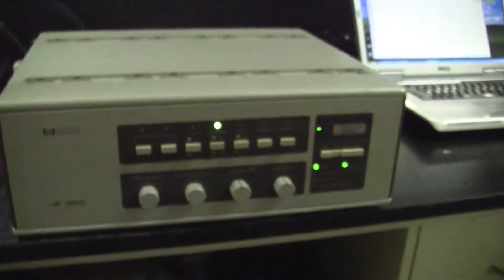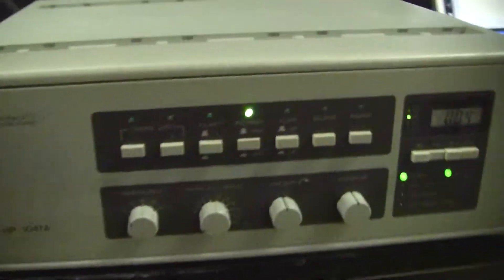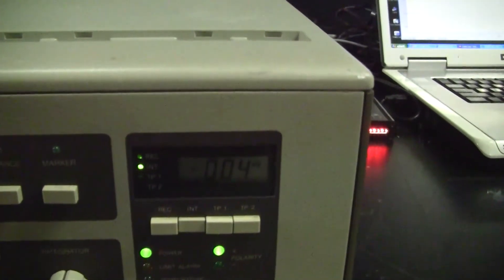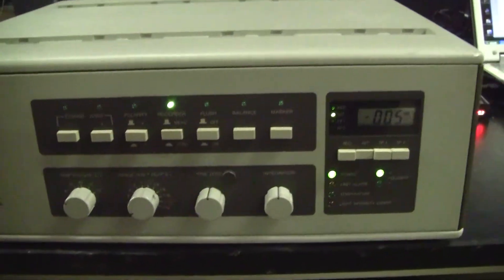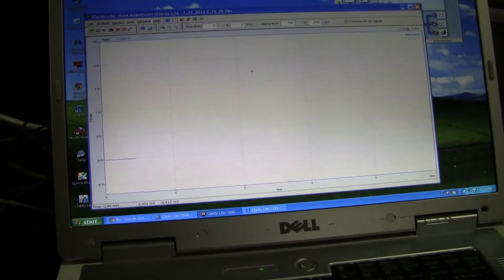Hi, this is Michael Natal from High Tech Trader. Today we're looking at a Hewlett-Packard 1047A refractive index detector. We've zeroed it out, we flush the system, and we're using an A to D converter into our ClarityLight software data acquisition system.